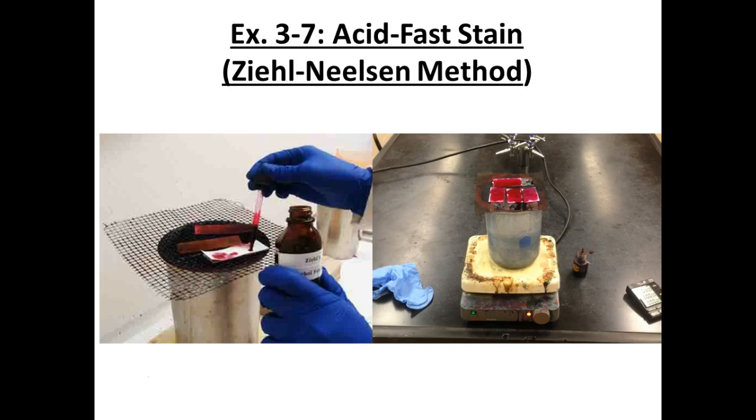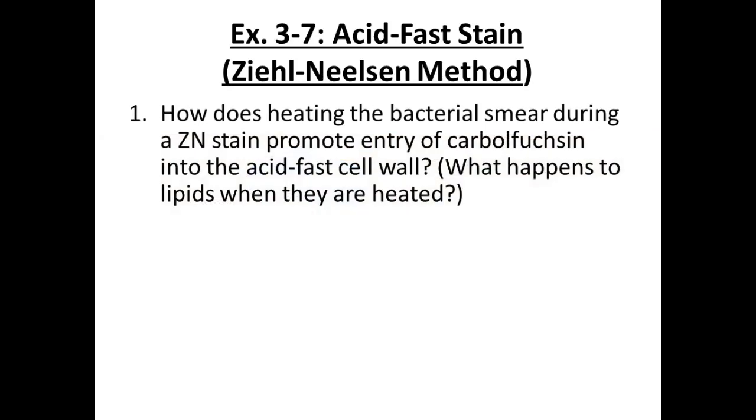It's just the first step for these 2 stains that you're going to do with heat. And that's how you're going to do it, is we have our steaming water, which I think we're getting there, huh? Getting warm. It'll be hopefully ready to go by the time I finish our lecture.